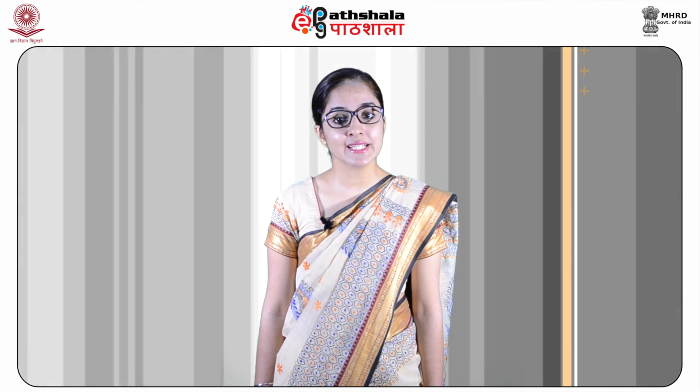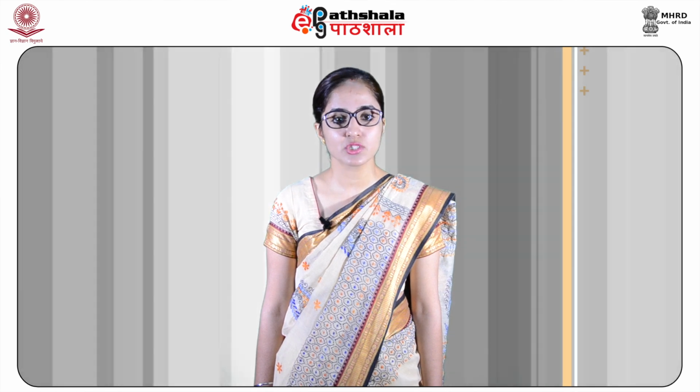In one-dimensional proton NMR, there are two axes. One represents the chemical shift and the other the intensity of the signal, whereas in 2D NMR spectroscopy, there are three axes. Out of these, two axes represent the chemical shift and the third one represents the intensity of the signal.